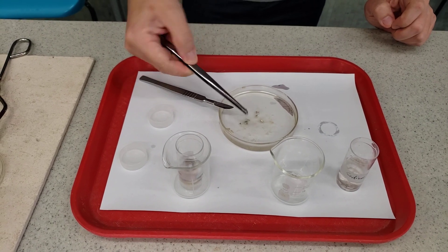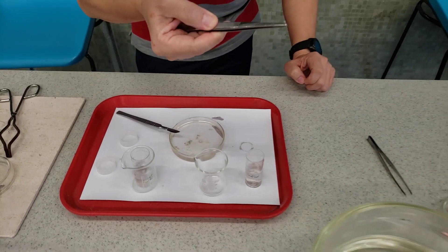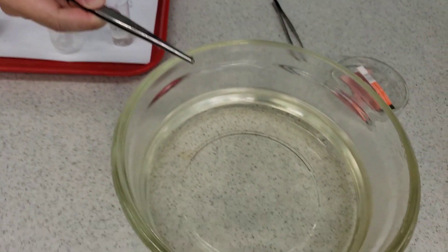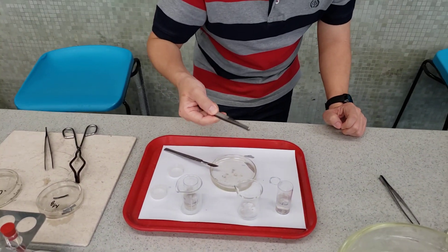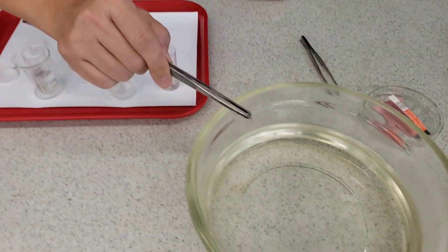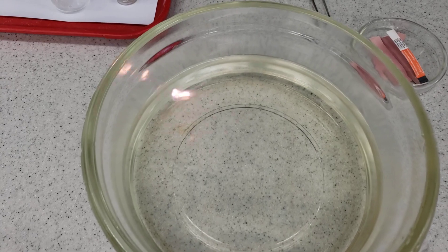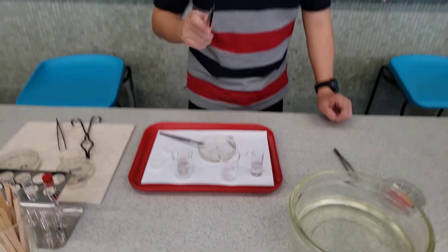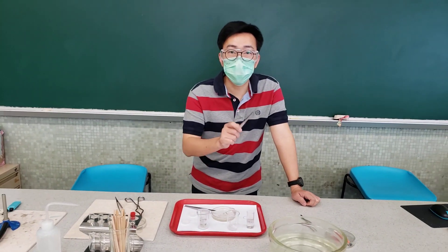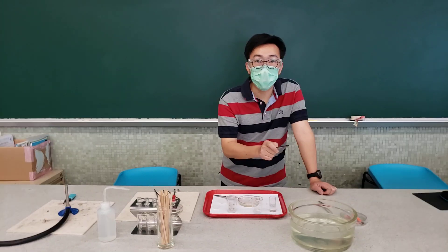Next I am going to put a piece of potassium into water. Let's see what happens. Anything different from the reaction before about sodium? As you can see, after I put potassium into water, potassium burns with a lilac flame.